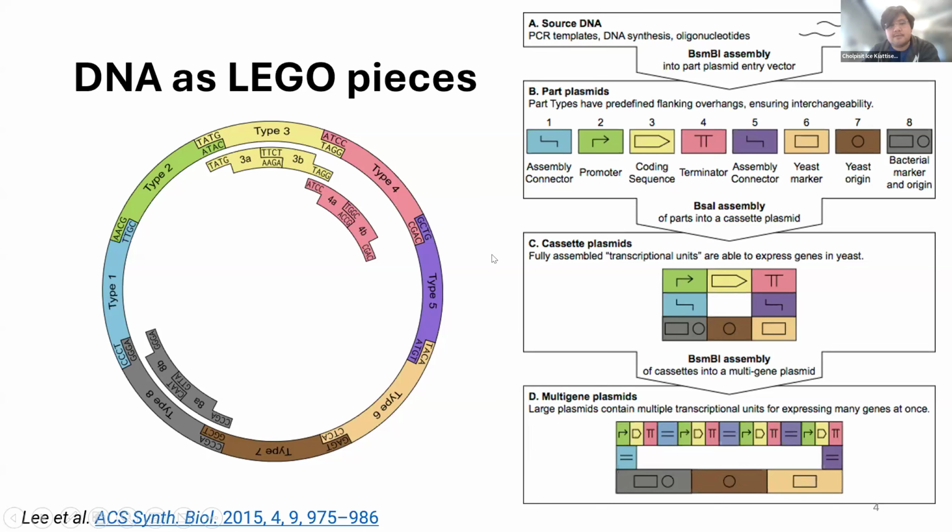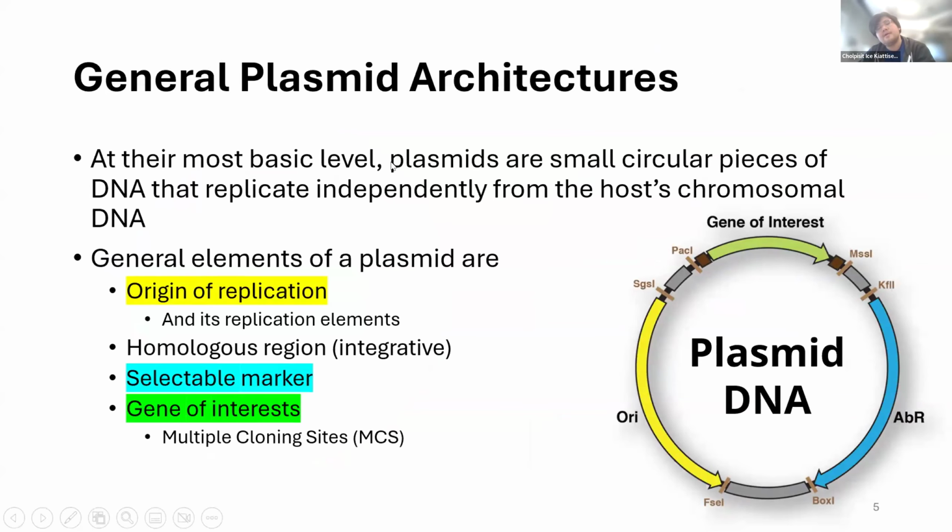Without our knowledge, it would just look like gibberish DNA information. But with our process of annotating and analyzing, we're going to be able to annotate these parts according to their function. So if you are working on a plasmid that can work in bacteria, most of the time they will need three main DNA elements.